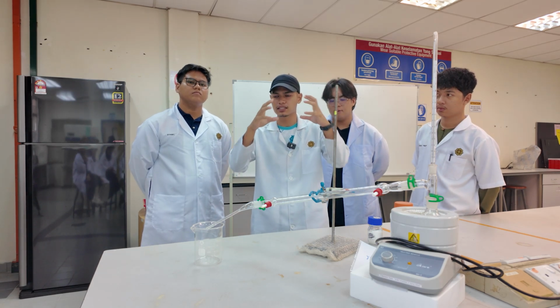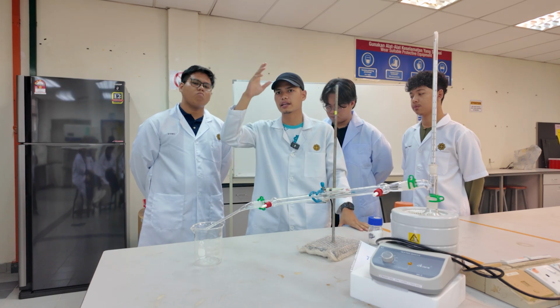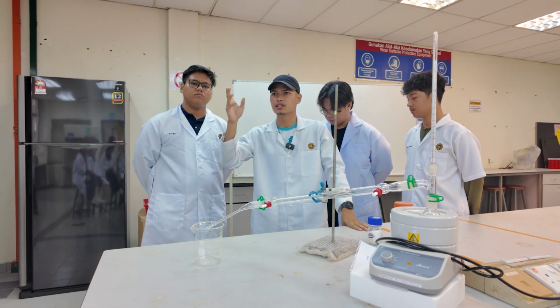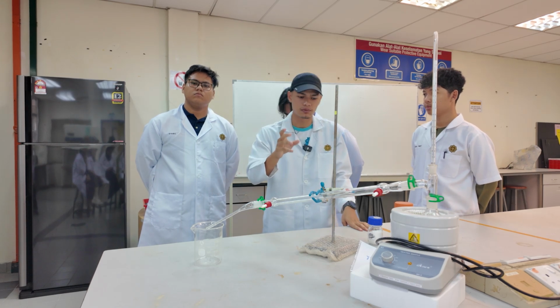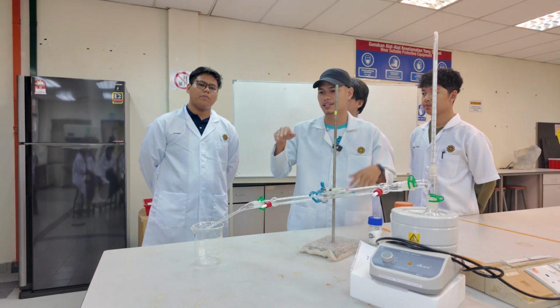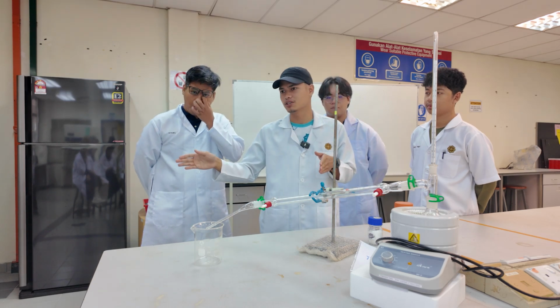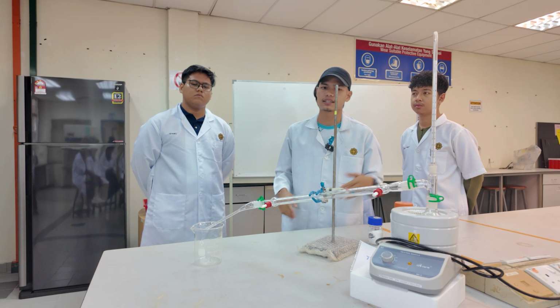The gel filtration is like a net. It will capture the small molecules, and the bigger molecules will not get trapped by the gel. So it lets the bigger molecules pass, and the smaller molecules come later.